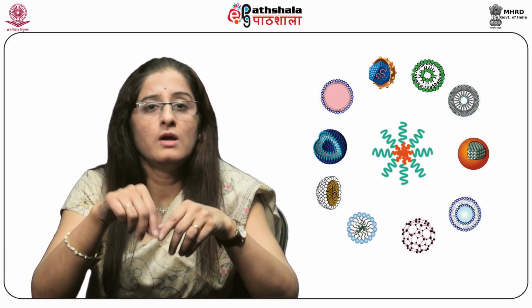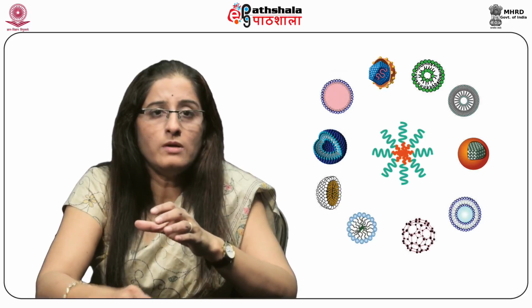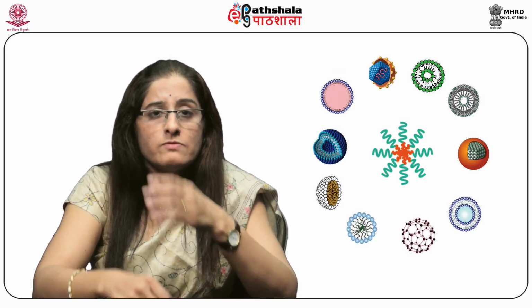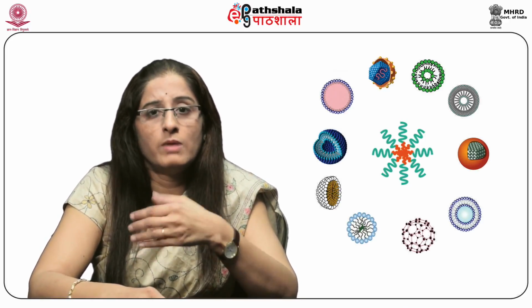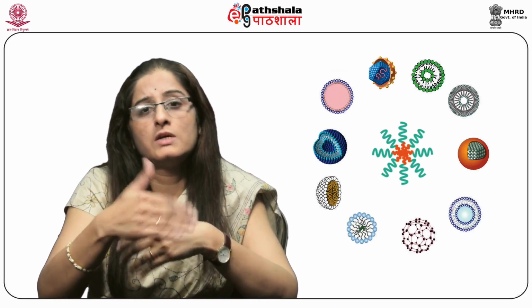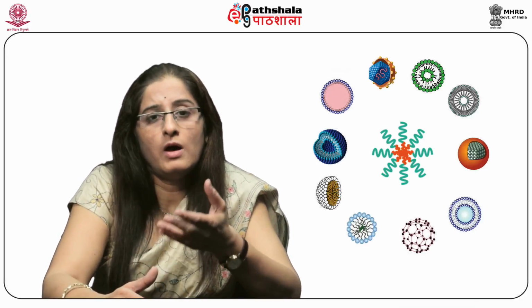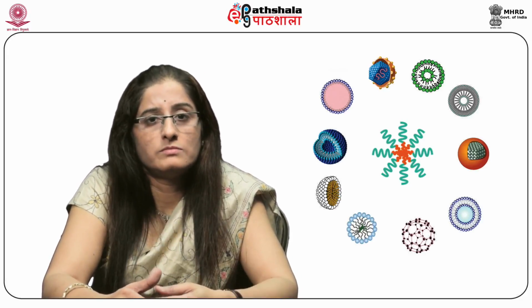After hydration, vesicles are formed due to swelling of lipid bilayer. These vesicles are large and multilamellar, which are then treated further to reduce their size either by sonication or by French press or the membrane extrusion method.